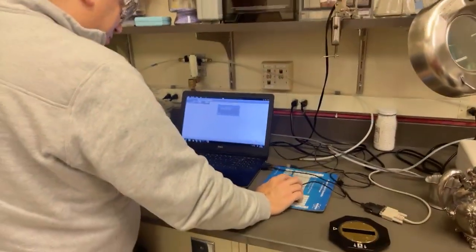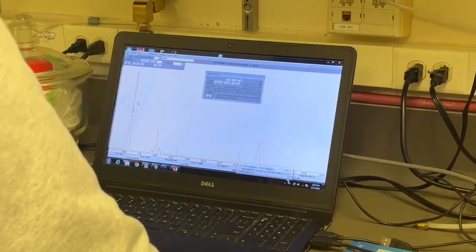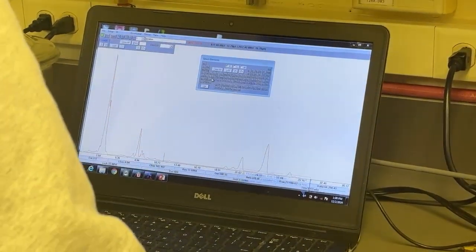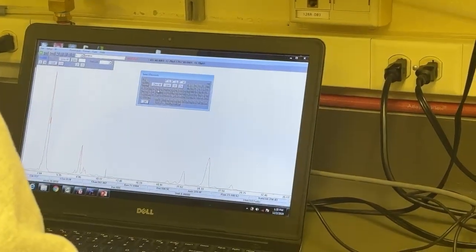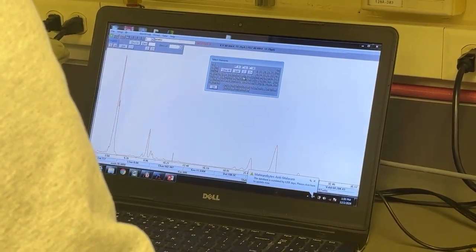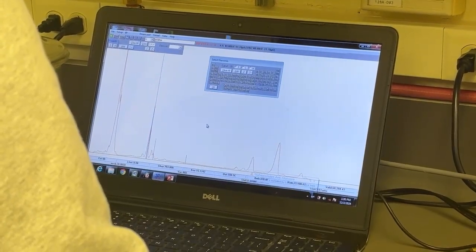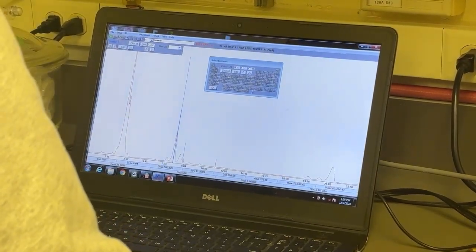Okay. So now we have a spectrum for this. Hey, that looks a lot like tin again. So that might be silver. Oh, that would be silver? Yeah. I'm having trouble reading the axis. Let me put the numbers here. So we definitely have copper, which is supposed to be there.